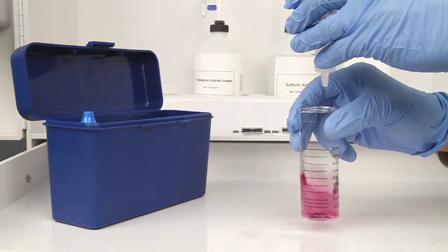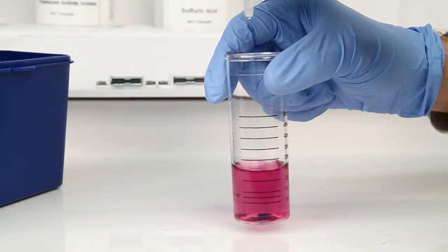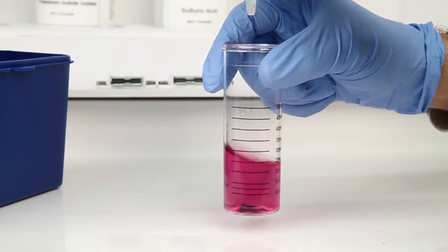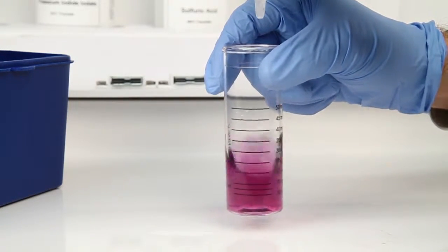The bottle of titrant contains a dropper tip, so it's important to hold the bottle vertically to ensure a consistent drop size. After the addition of each drop of titrant, swirl the vial to make sure the sample is properly mixed.